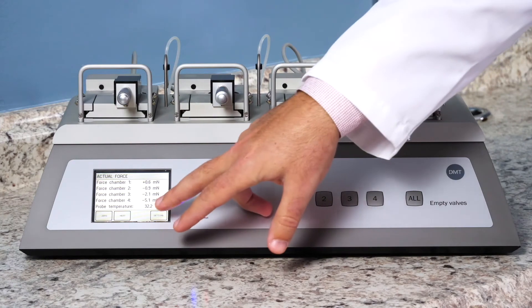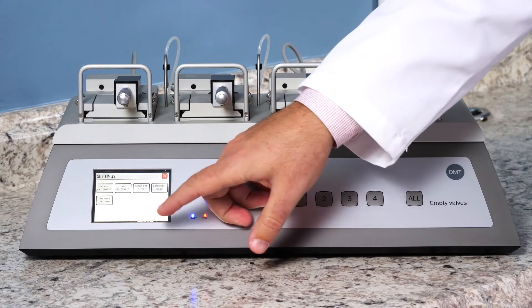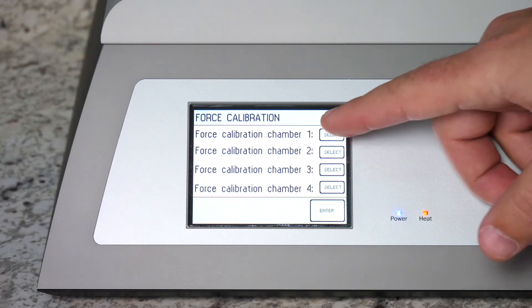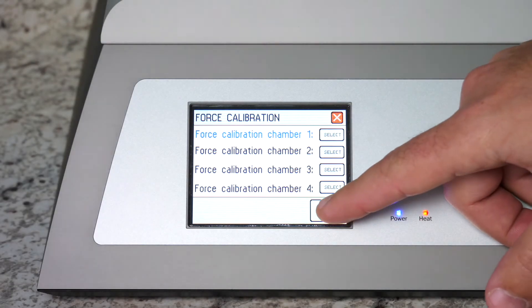To access the force calibration menu you will go to the settings menu and then the force calibration menu. You will then select the chamber that you're going to calibrate, highlight it and hit enter.